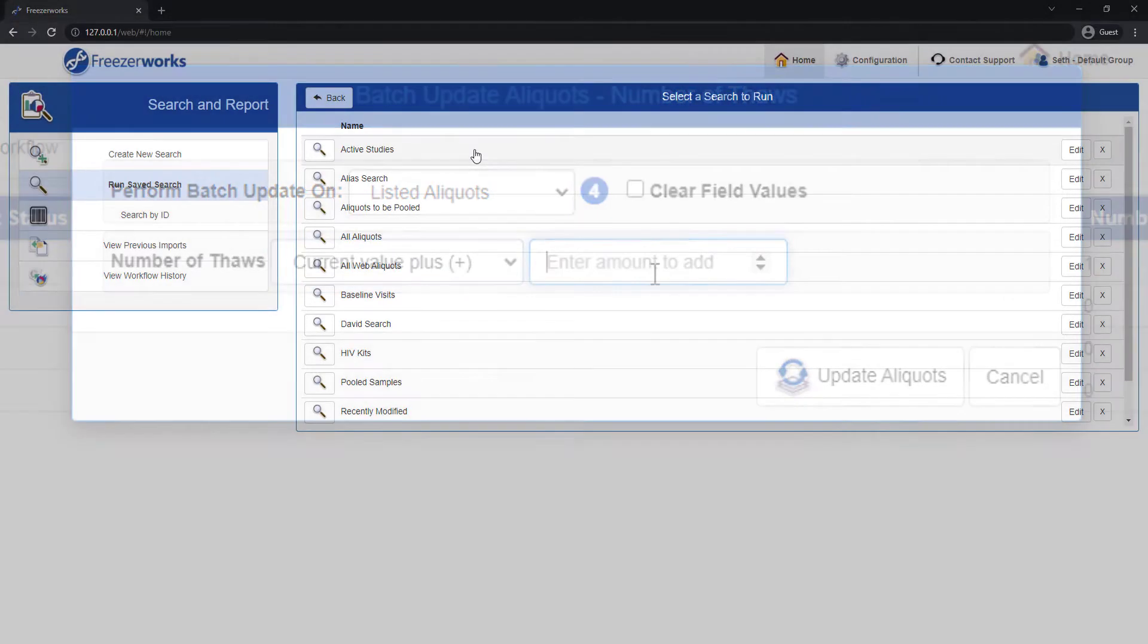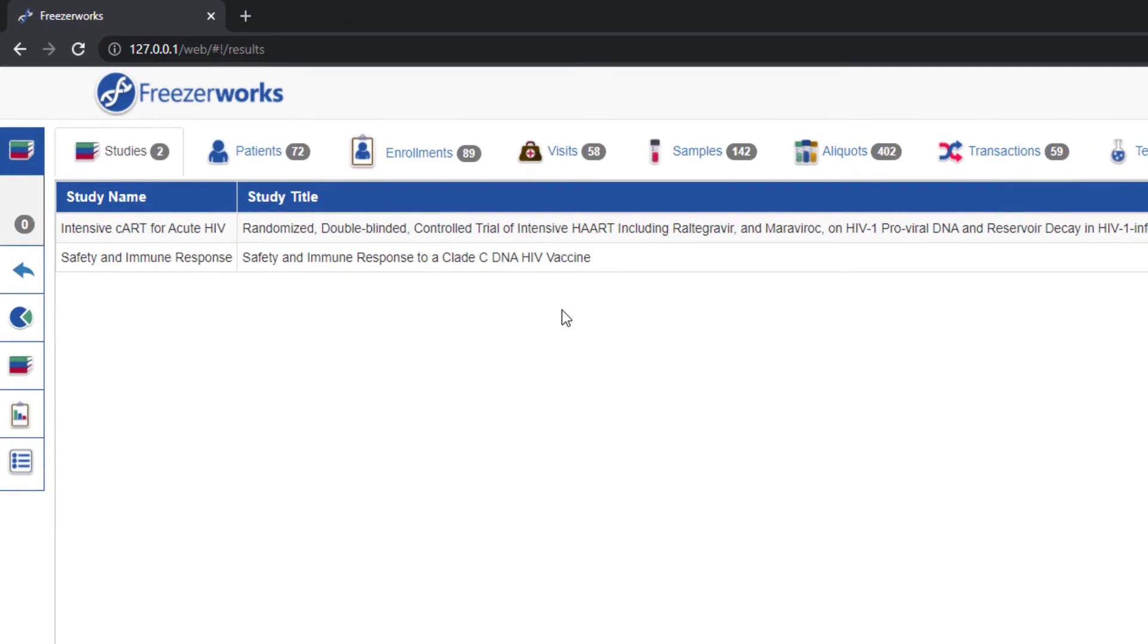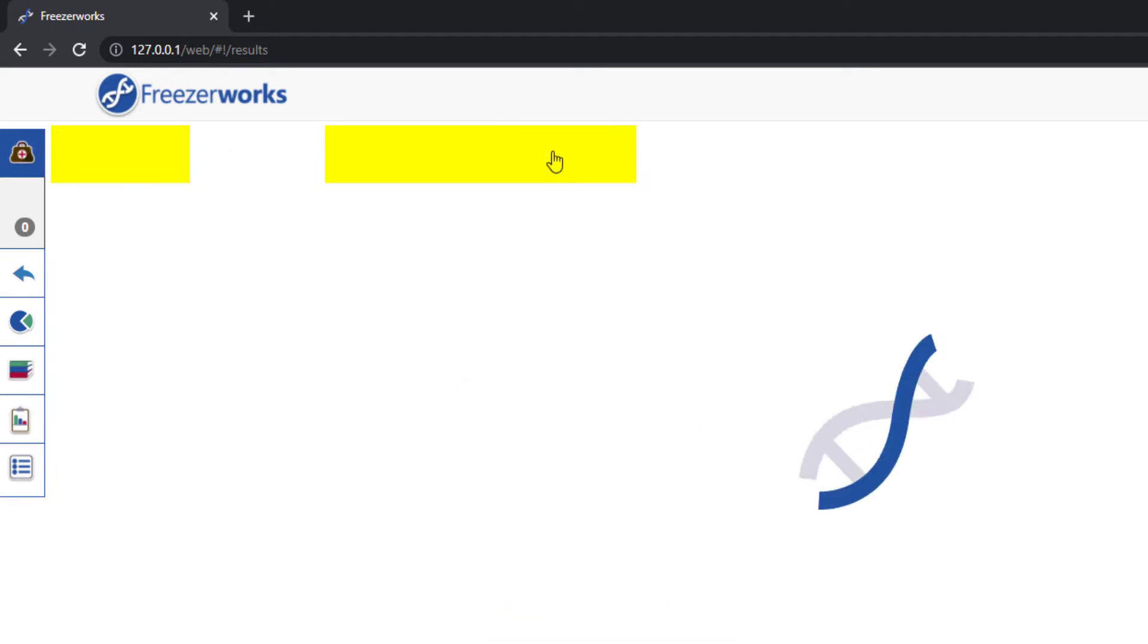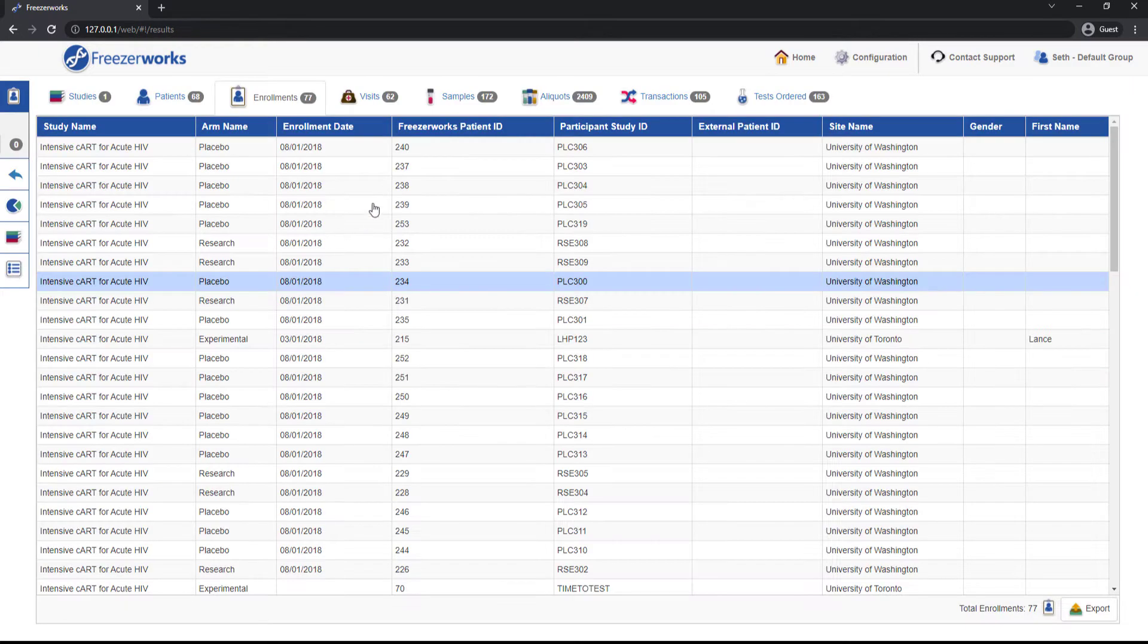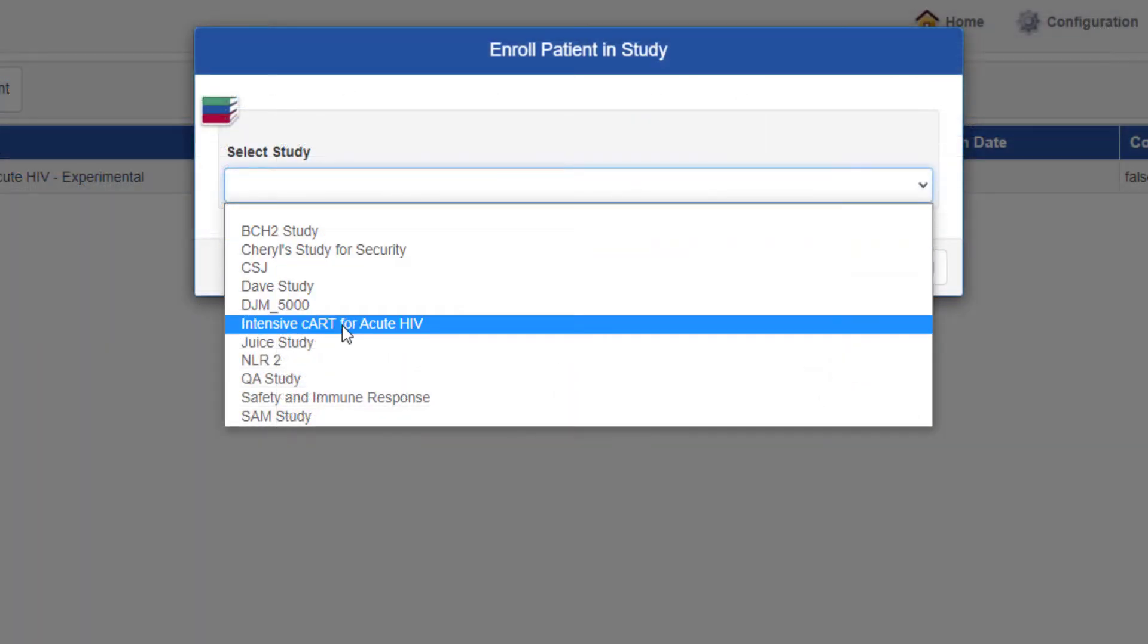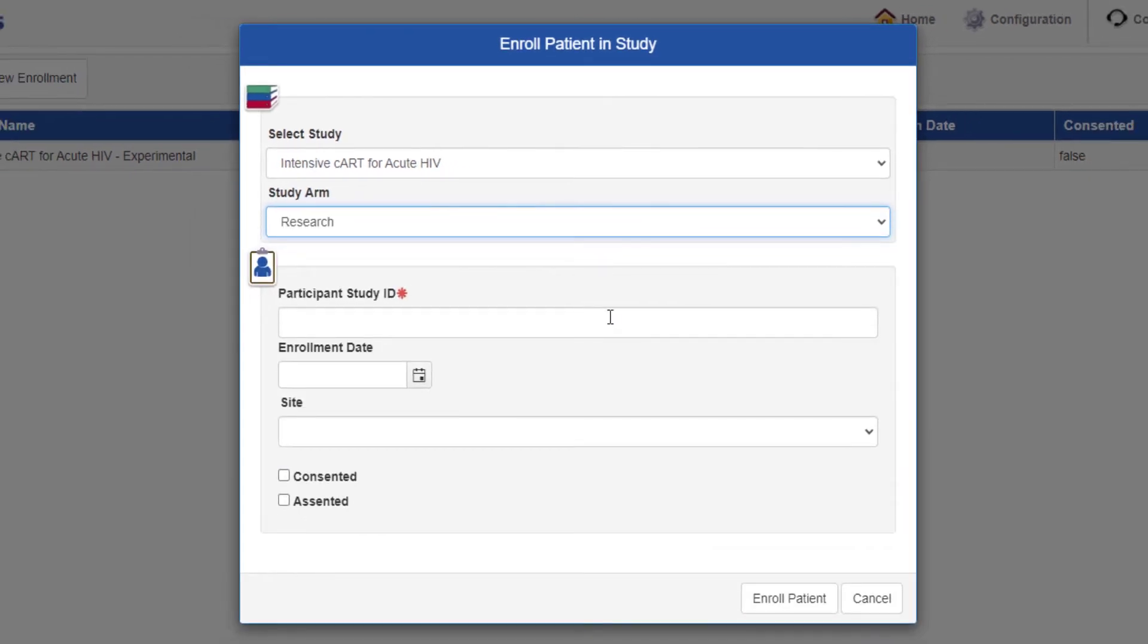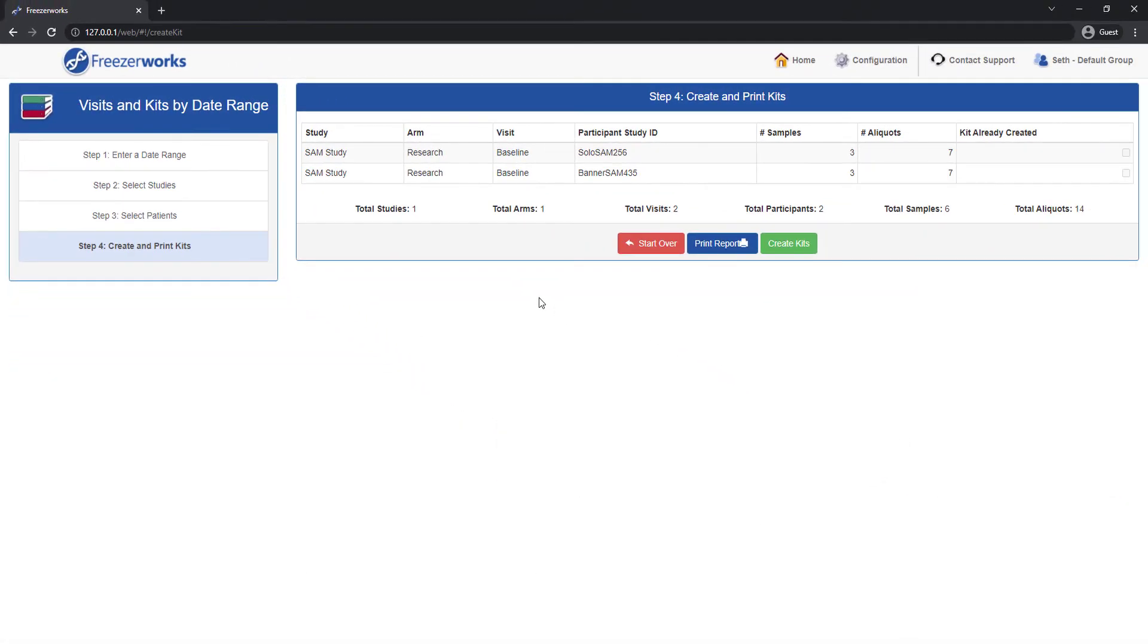Those two updates to the web client weren't quite enough for us, so we chose to include study management there as well. With Pinnacle on the web client, you can now view studies, visits, and a brand new addition, enrollments, and use the fields contained in those tables for searches, reports, charts, etc. The inclusion of Pinnacle in the web client means you will also be able to enroll patients and create kits without having to open the desktop.